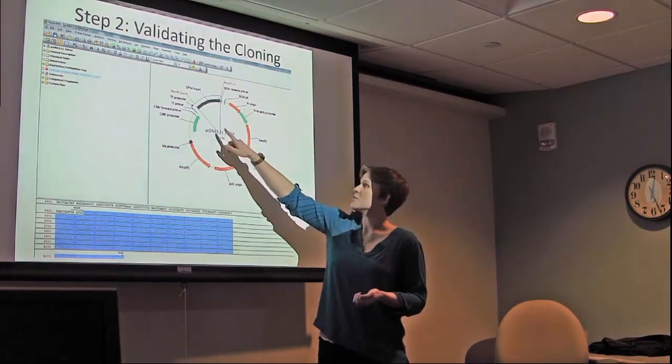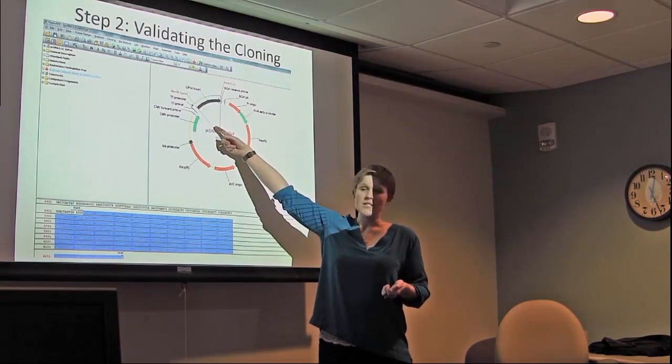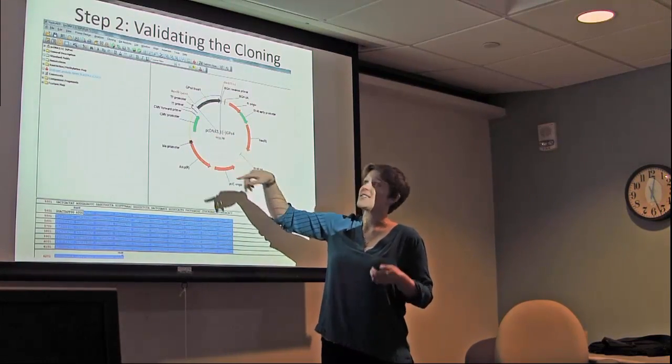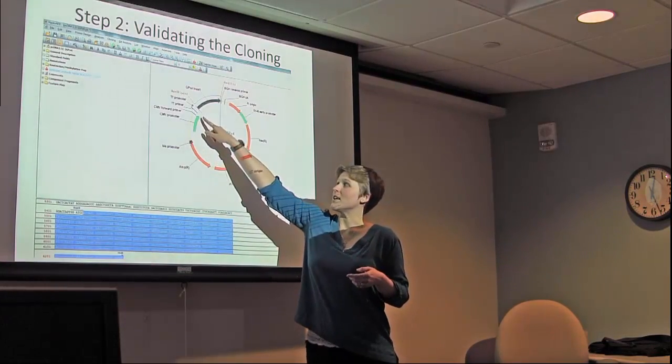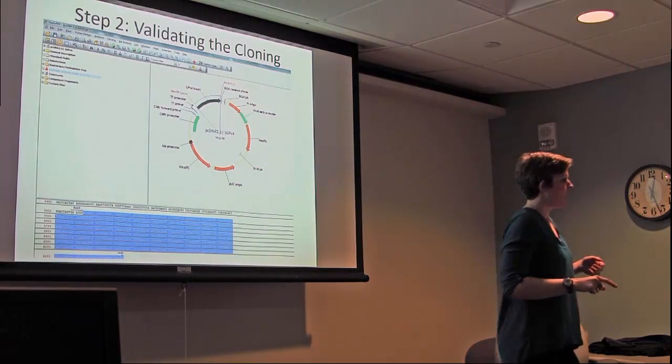So what I have here between my BamHI site and my HindIII site is my GPX4 insert, and this is occurring after the CMV promoter and the T7 promoter, so it's where it needs to be. And it looks good.